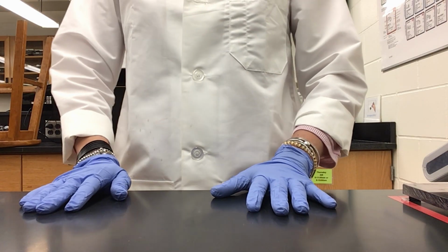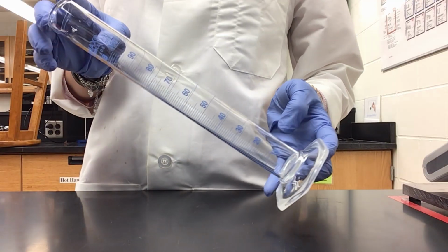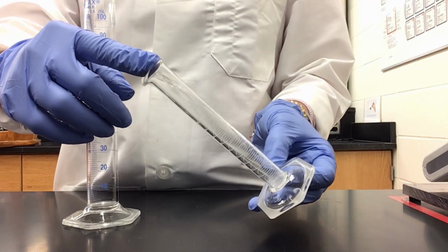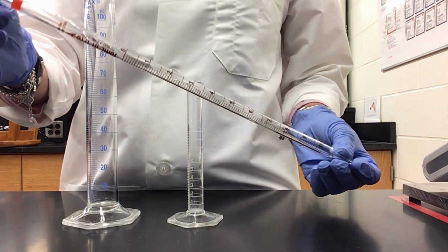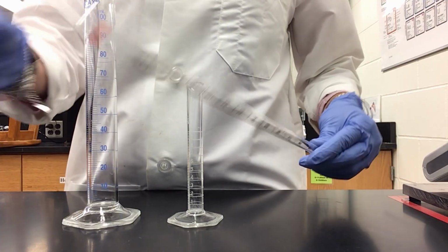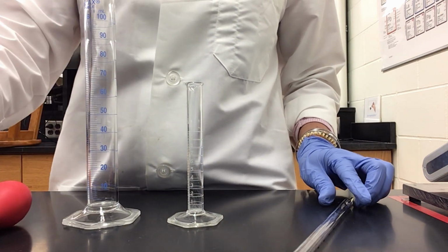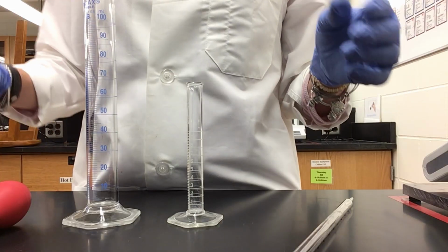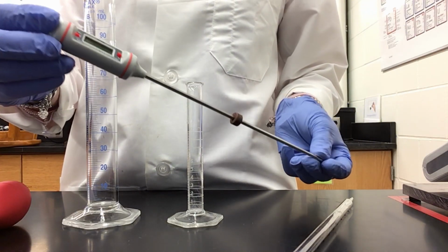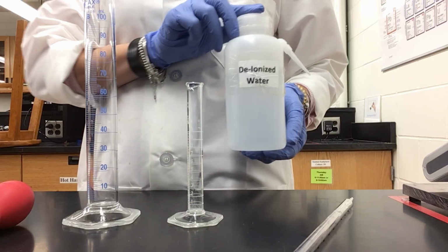For part 1, we are going to need the following items. We are going to use the 100 milliliter graduated cylinder, the 10 ml graduated cylinder, the 10 ml graduated pipette. So for the pipette, we are gonna need the bulb, and then we are going to use a plastic vial with cap and a thermometer. The only chemical that we're going to use is deionized water.